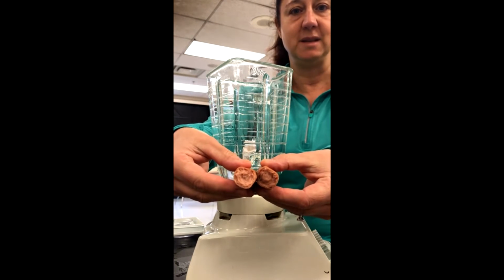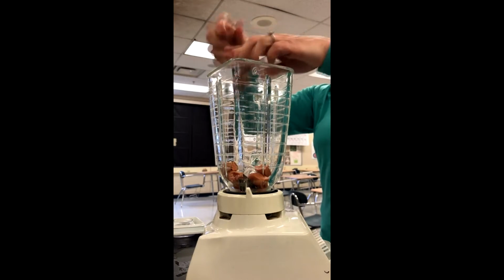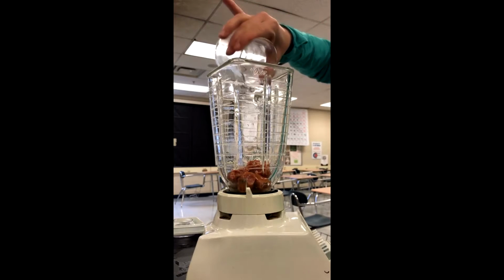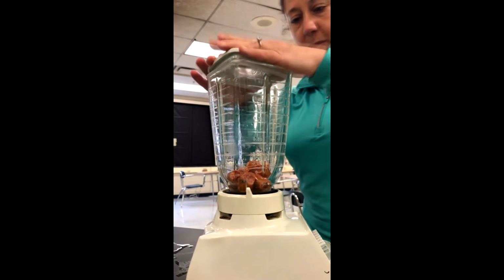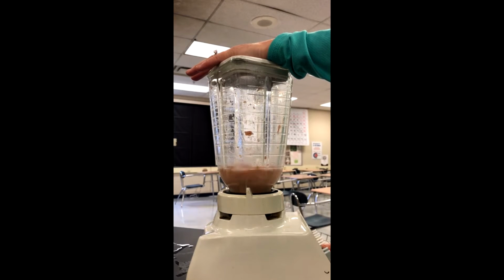And I'm gonna break it up into pieces, big chunks, and put it inside the blender, like so. Then I'm gonna add some hot salt water and turn it on. And that's going to help pull out or extract the oils that will be inside the hot dog. So I'm gonna begin by just grinding it. And then I'm gonna liquefy it.